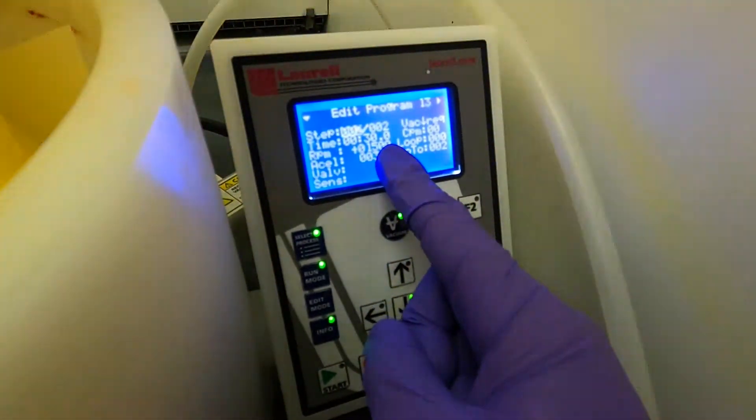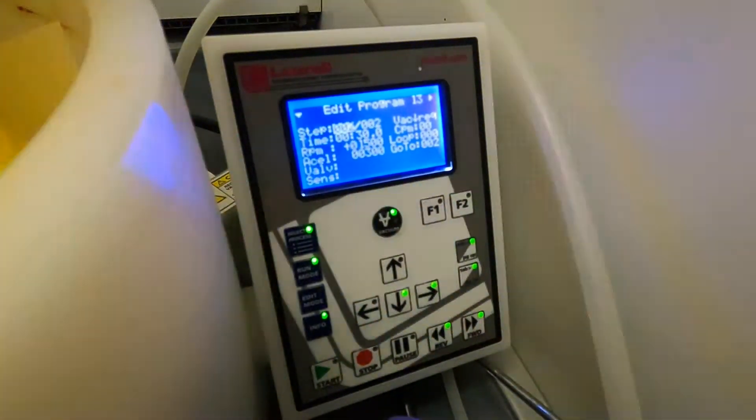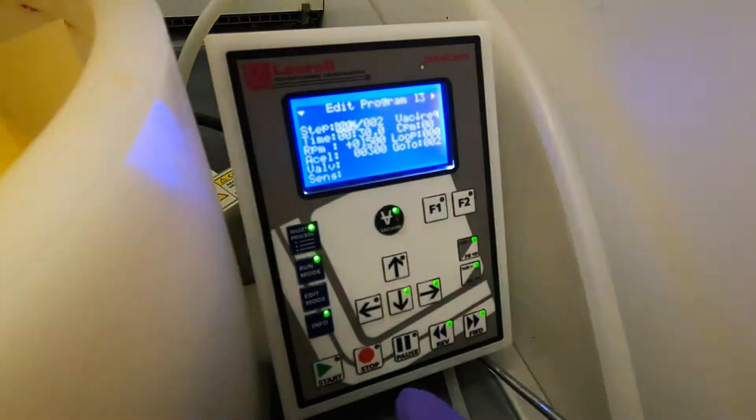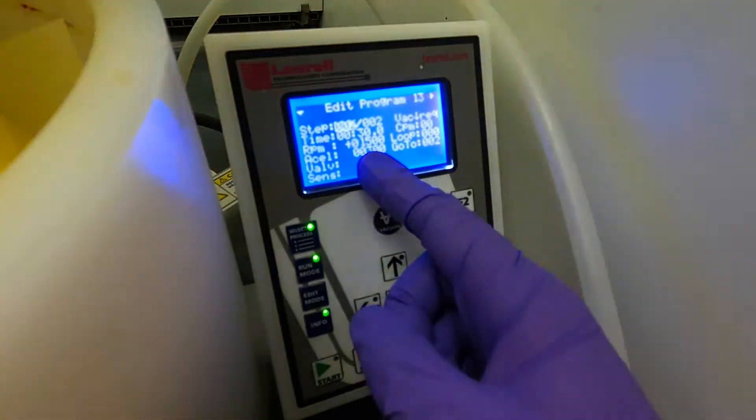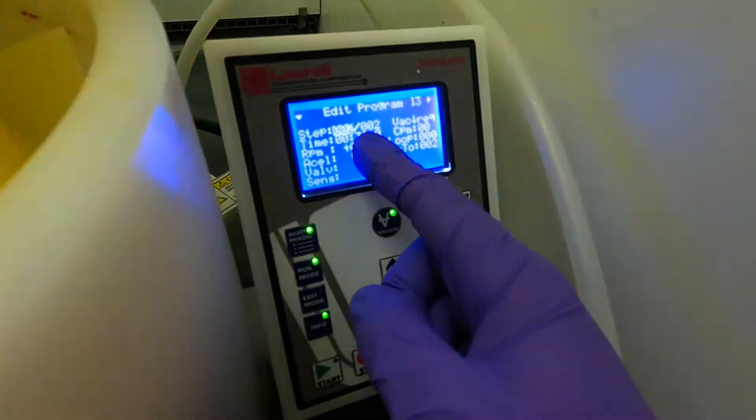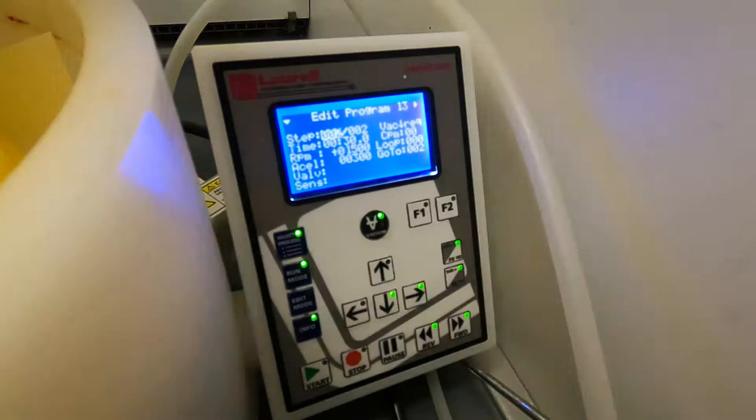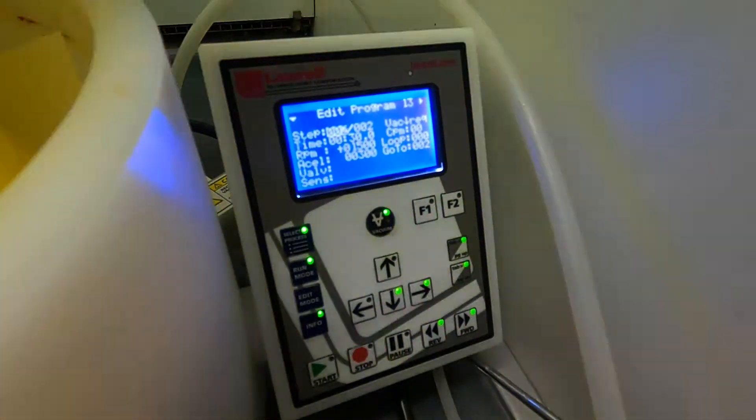This speed of 1500, this is something that I set to get the thickness that I want. But if you want to tweak the thickness you will need to change this number. Always make sure that if you go to high spinning speed, because the acceleration has a finite value, you might have to increase the spinning time to allow enough time for the spin coater to accelerate to the rpm setting that you want.